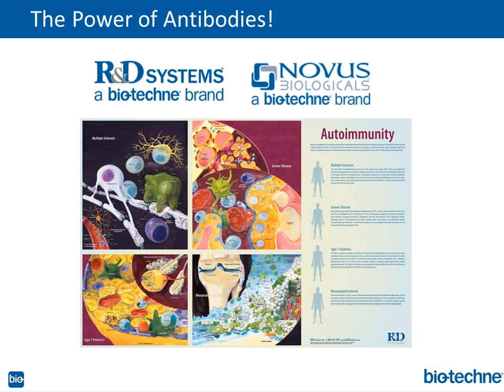Of course, you've got monoclonals, you've got polyclonals, and it really depends on the point of your experiment, what gives you the best immunoreactivity. Some people want to see multiple bands. Monoclonals go for one epitope. Polys go for multiple epitopes, and tend to be more robust.